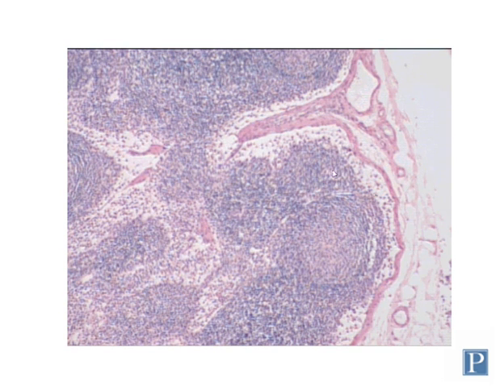Here's another section showing the cortex. Here you can see another secondary lymphoid nodule. Here's more of a primary lymphoid nodule. Here's the connective tissue capsule. Here's a trabecula, paratrabecular sinus, subcapsular sinus.